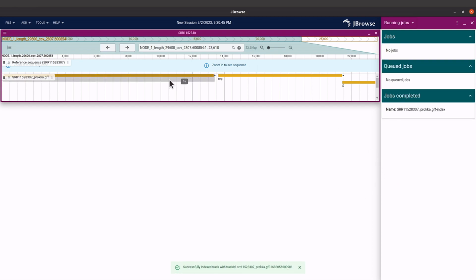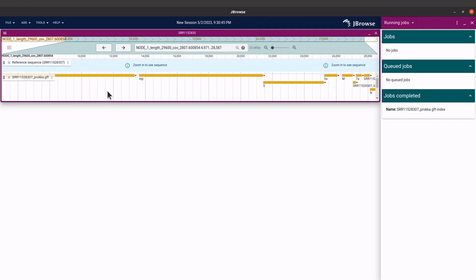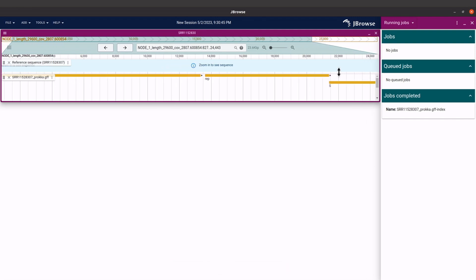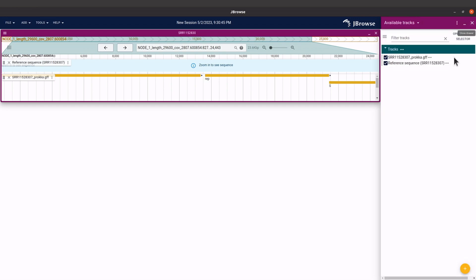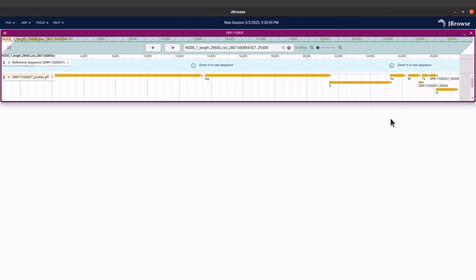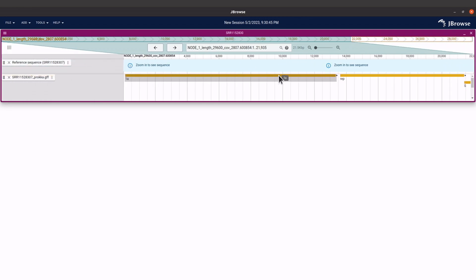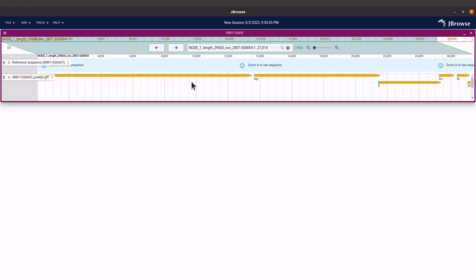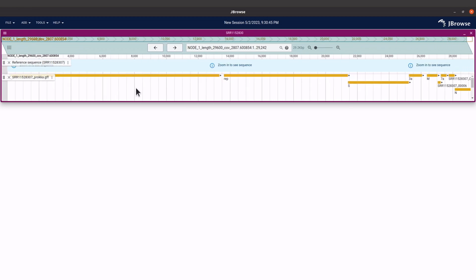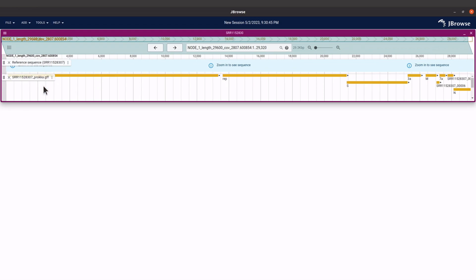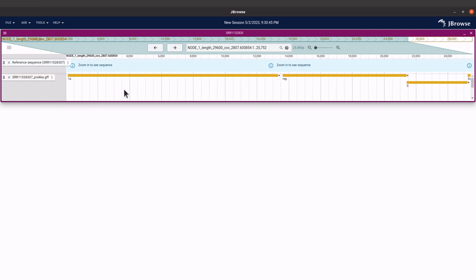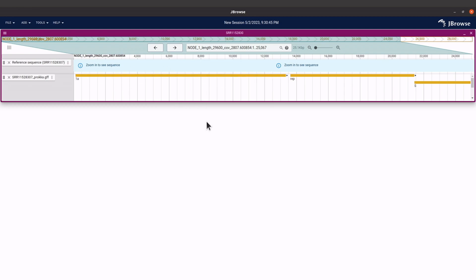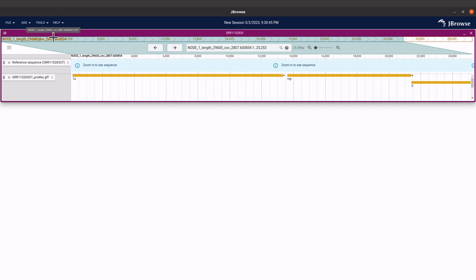Once you click on 'Add', you will find this appearing. Let's minimize or close this panel — you can always open it back. Once you do that you have your annotation, and you can drag left and right to check what you have. The names are covering some parts so you can drag to the right a bit to see everything.